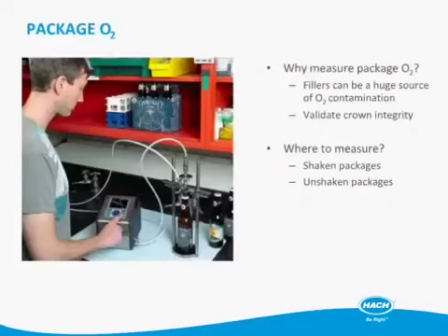The reason that I think it's important to measure package O2 is because you can really look at things and validate exactly what's happening. You can look at your O2 at the base of the filler. You can look at the O2 in an unshaken package after it's been filled.